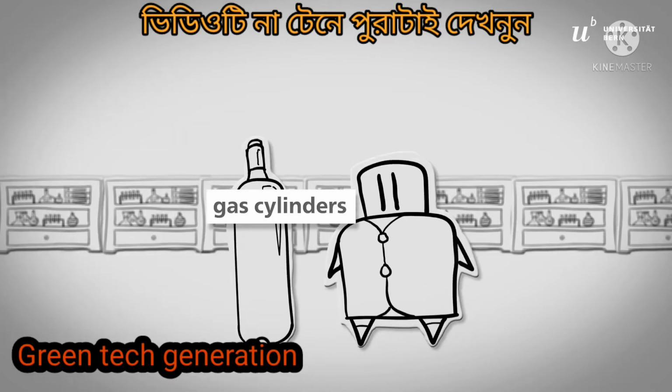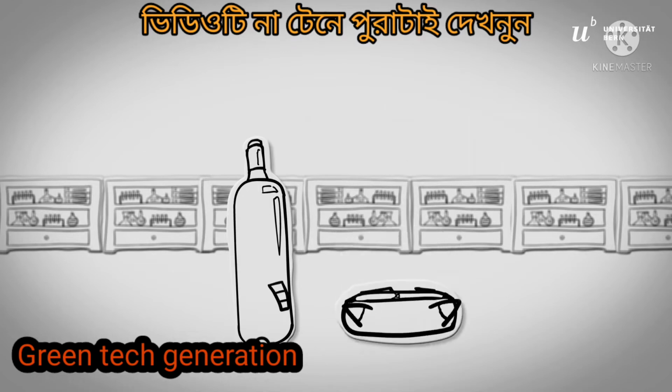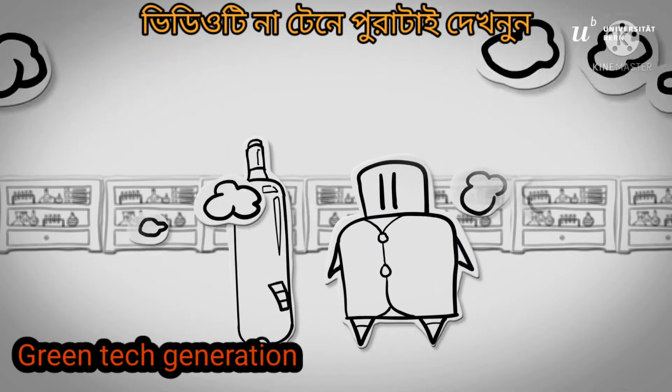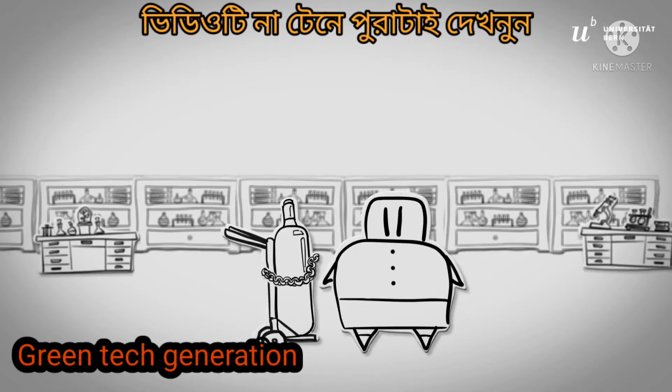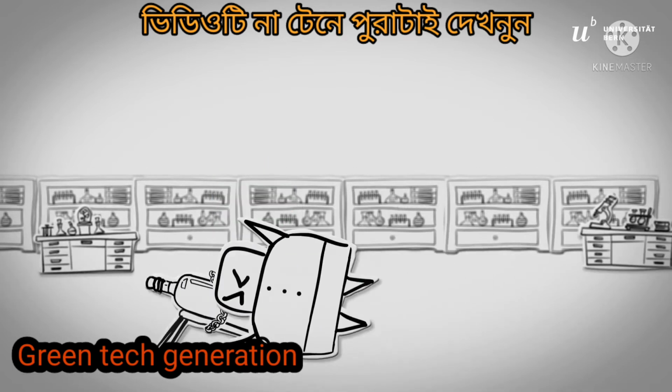With gas cylinders, it is crucial that there is no damage or leakage. They pose hazards such as suffocation, flammability, explosion, and poisoning. To minimize risks, gas cylinders must have a cap screwed on and be secured against falling over.